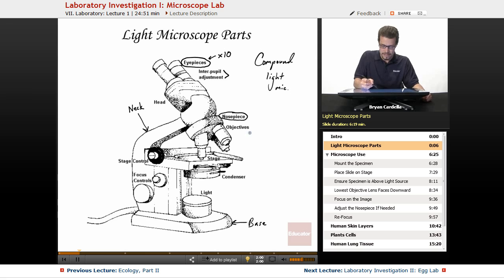Now when it comes to the objective lenses, there are typically three. Some microscopes have four. And the objective lenses, a lot of times they'll be a red one, a yellow one, and a blue one. And I've also seen ones that have a white stripe around it. Now the red by itself is times 4, the yellow by itself is times 10, and the blue by itself is times 40.